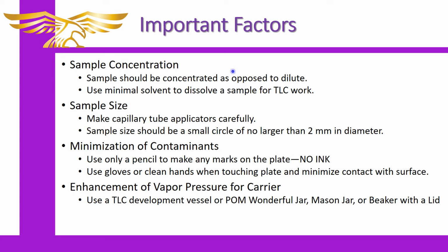And the easiest way to go about that is to use the minimal amount of TLC solvent possible. It is important to note that when you do a TLC, you use the same solvent to dissolve the compounds as you do the solvent you're using for your eluent. You usually don't mix different solvents together because that would introduce new compounds into the equation. So when you do that, it's important to make sure you minimize the amount of solvent that you're going to apply in this situation. And you also want to be cognizant of your material.